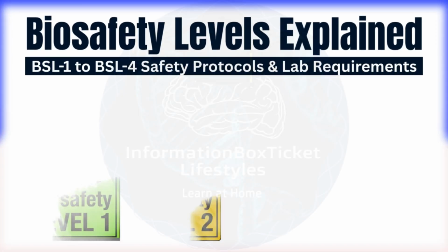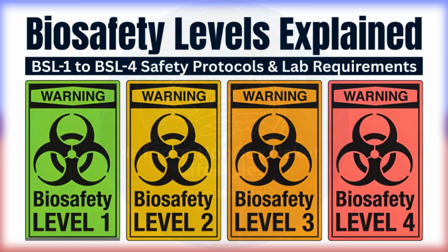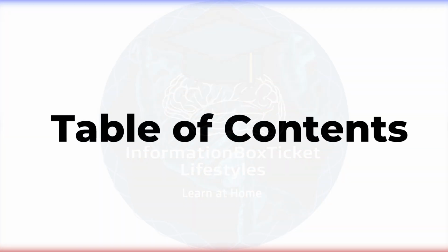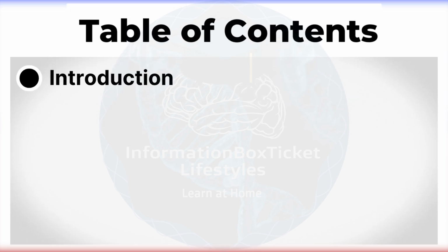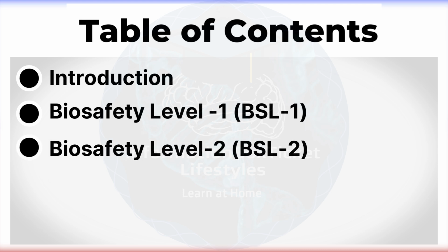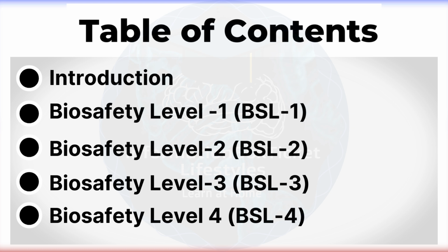Biosafety Levels Explained, BSL-1 to BSL-4, Safety Protocols and Lab Requirements, a comprehensive guide. Table of Contents. Introduction to Biosafety Level. Biosafety Level 1, BSL-1. Biosafety Level 2, BSL-2. Biosafety Level 3, BSL-3. Biosafety Level 4, BSL-4.